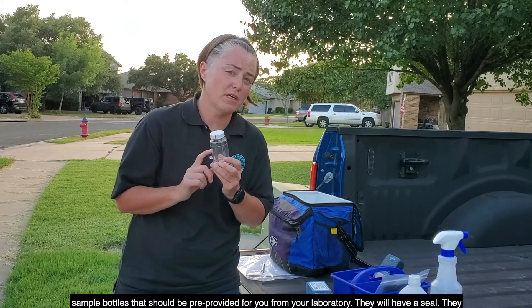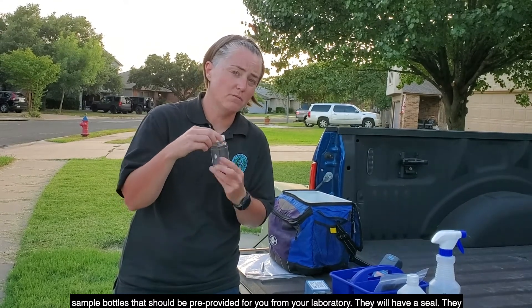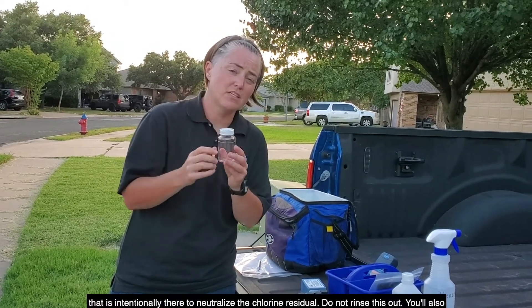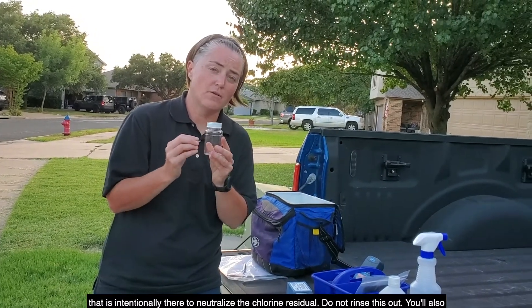The sample bottles should be pre-provided for you from your laboratory. They will have a seal, a marked 100-milliliter line, and they'll either have a powder, tablet, or liquid inside that is intentionally there to neutralize the chlorine residual. Do not rinse this out.